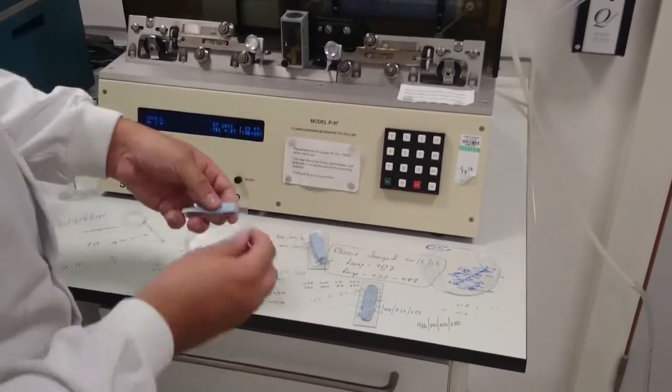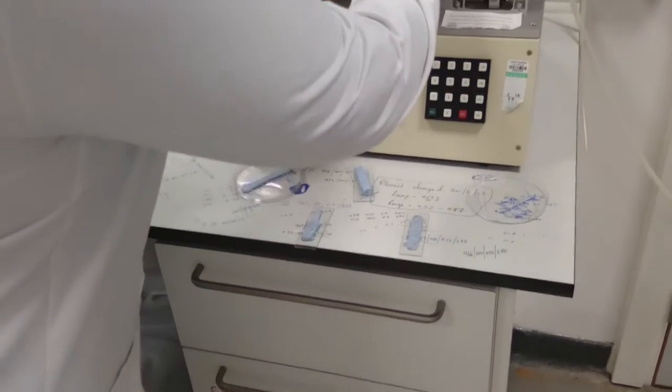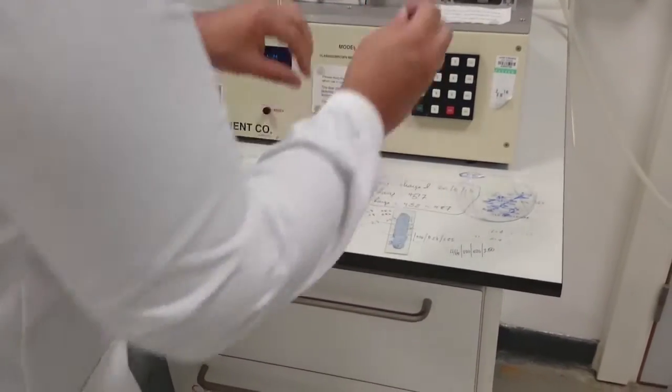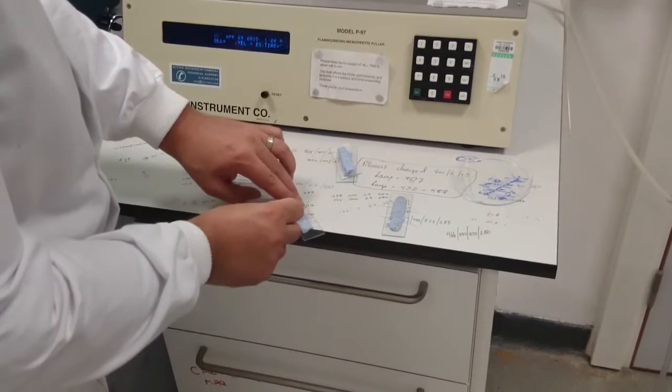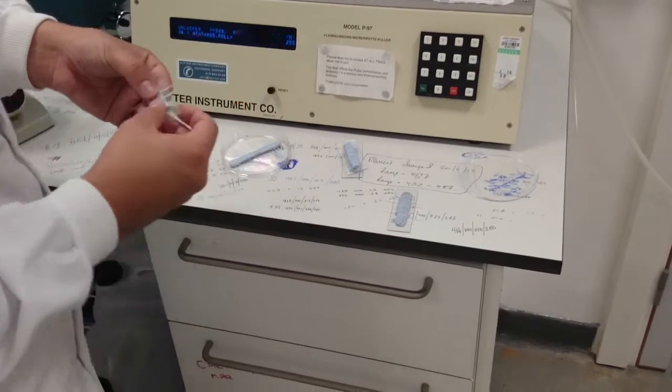It's important to check your tips under a microscope to make sure they've pulled properly. Some tip settings lead to fused tips or broken tips. When a tip is pulled, the end becomes very fragile. I'm now going to show you the difference between an intact tip and a broken tip under the microscope.